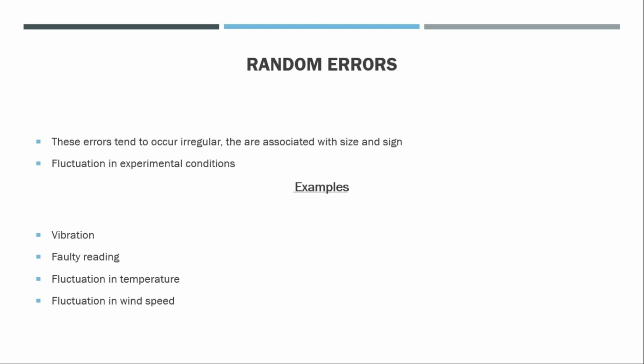So for example, you're taking the measurement of some liquid in a measuring cylinder on your desk, and there is somebody who keeps moving about and bouncing the desk, and you find that you might be off with your measurement. Of course, you could also have faulty reading. If you have the same person keep taking the reading over and over, then this might expose your group to some challenge. You might be experiencing random error. You need to rotate the person that is doing the reading, give them adequate time, ensure that they are seeing well. If they have to be wearing eyeglasses, ensure that they have it on, right? So make sure that you're doing good reading.